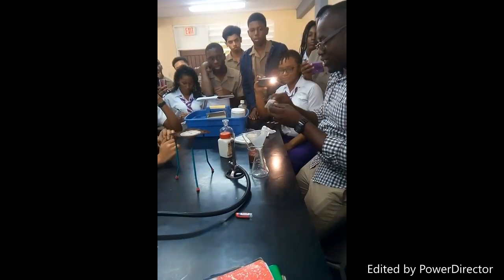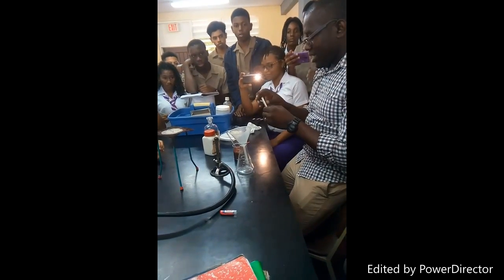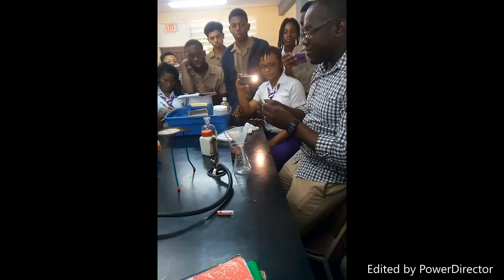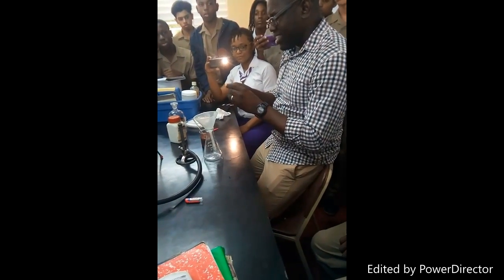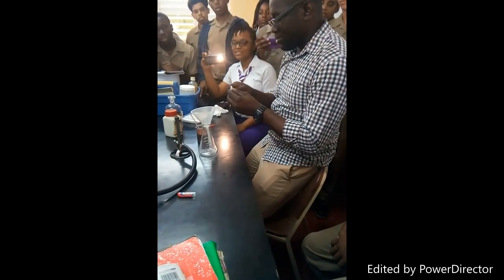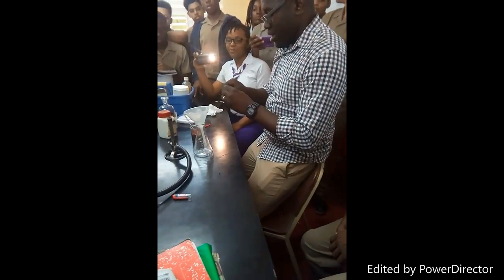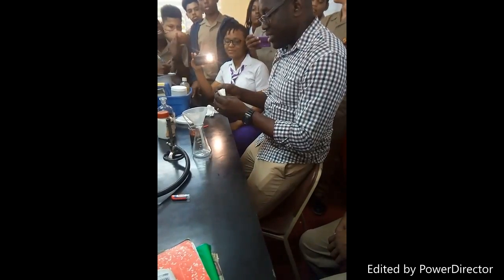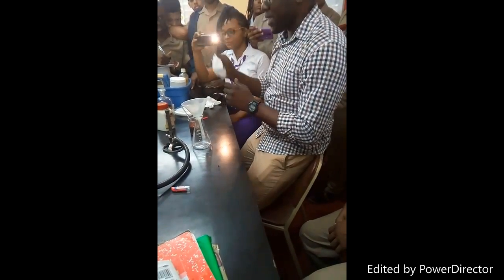That's not fluting. I was just checking to see if you guys did it. So you fold it in halves, this is the regular way, and then you fold all the halves into halves. So you increase the surface area. Didn't you do this in third form? When you did filtration, did you flute the filter paper? Some did, some didn't. So you see, you have increased the surface area by just doing that.